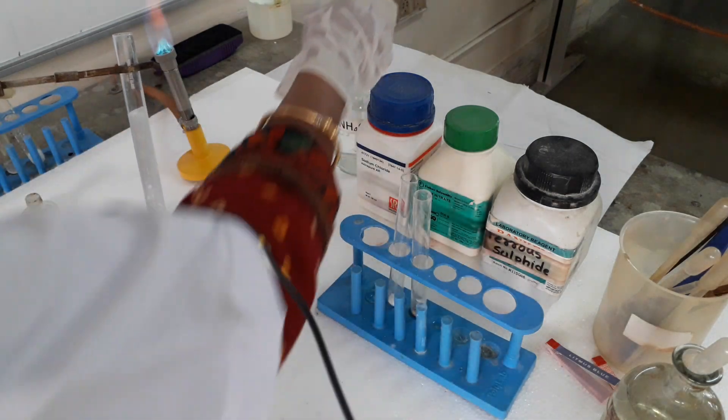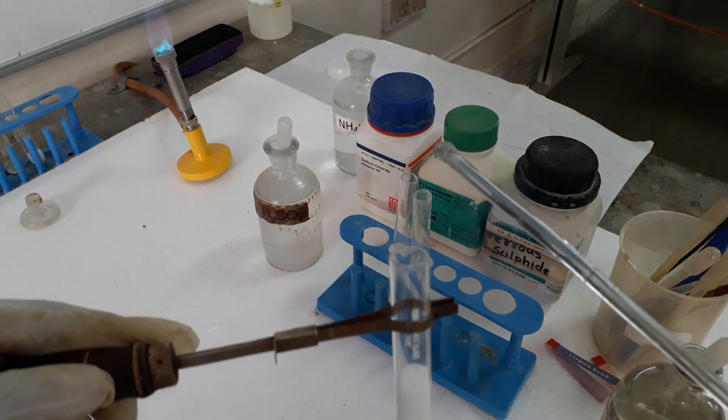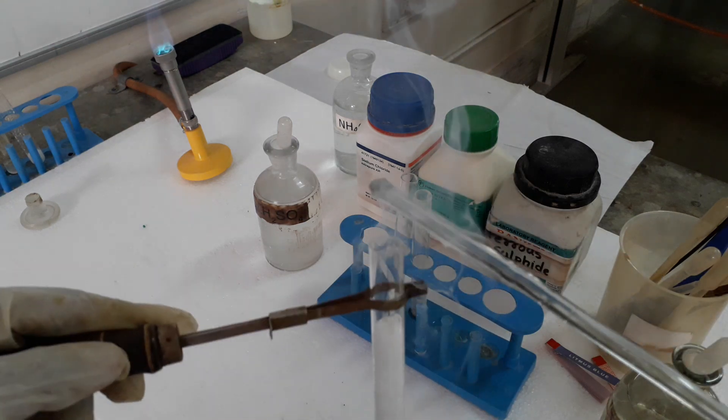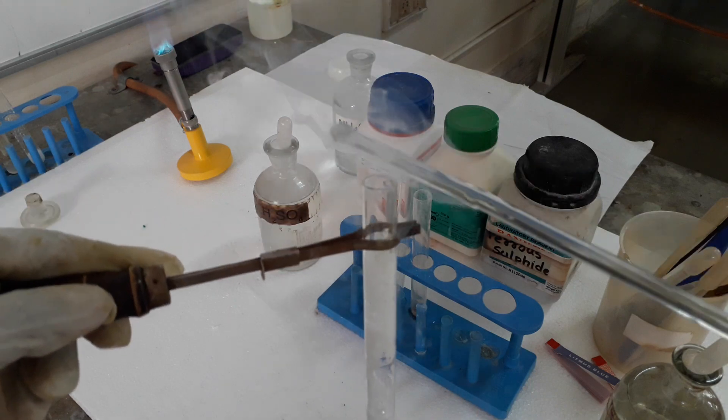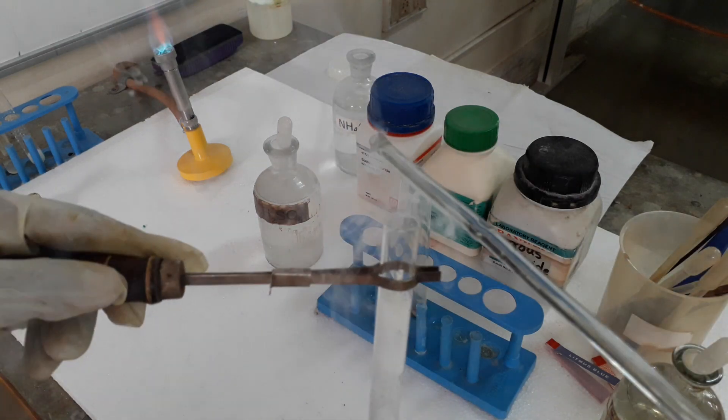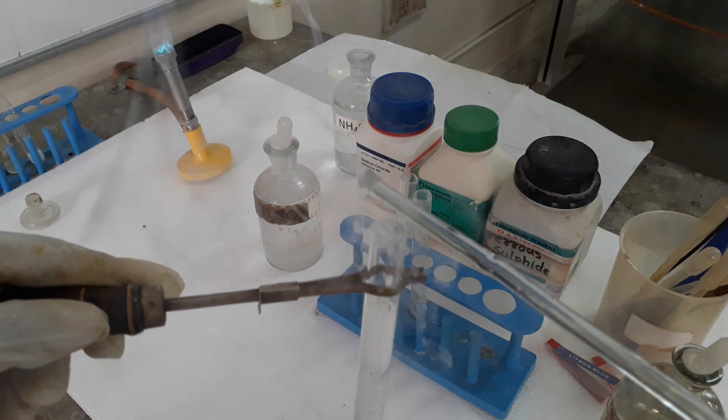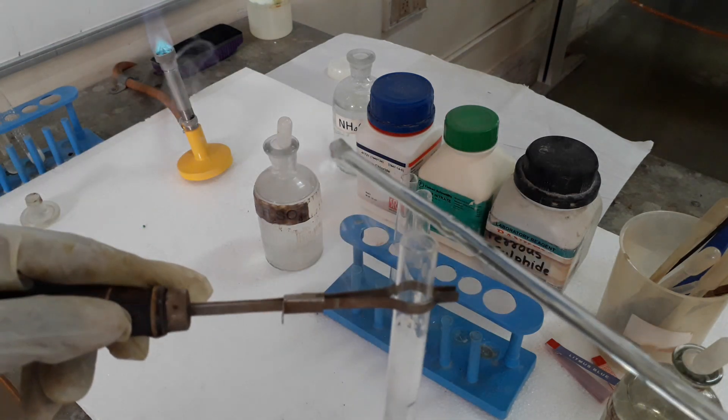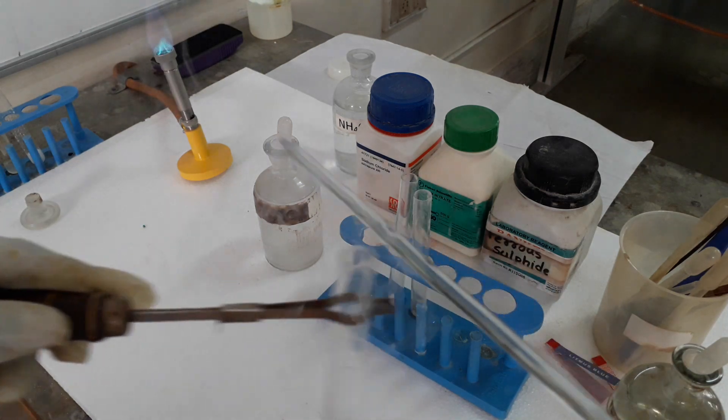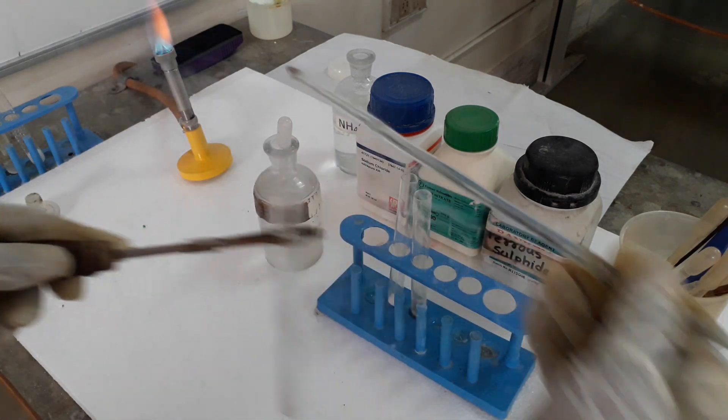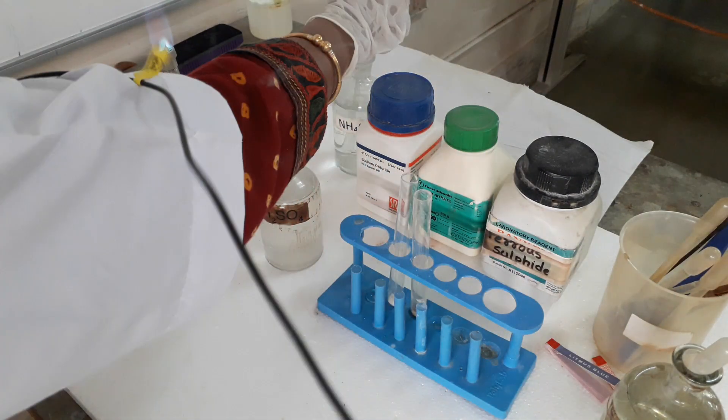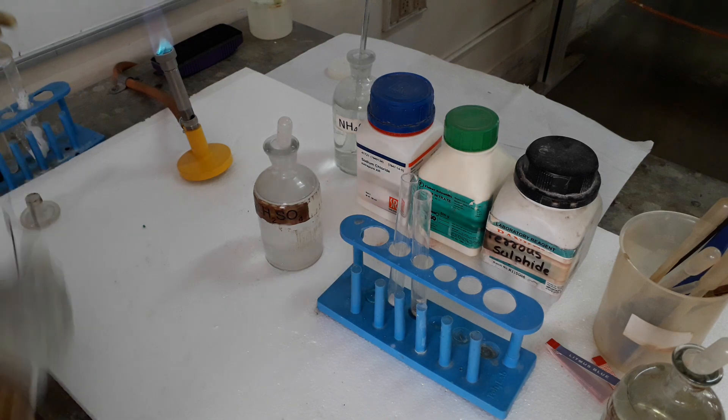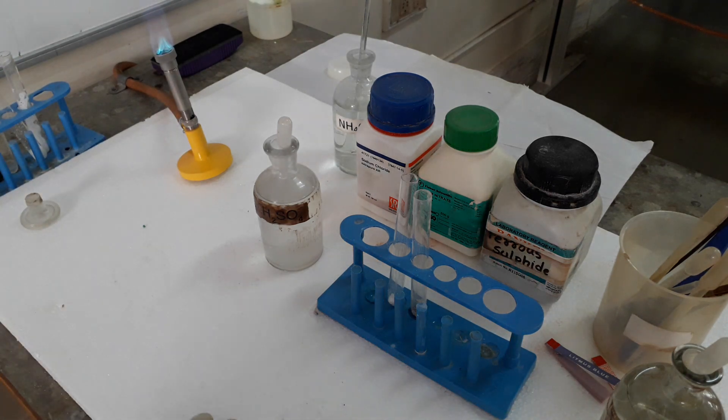Now how to confirm that the gas is HCl? I am bringing a rod dipped in ammonium hydroxide. We will see dense white fumes coming out from the test tube. These dense fumes are actually tiny solid particles of ammonium chloride, and this confirms that the salt has chloride as anion. So chloride anion we detected.